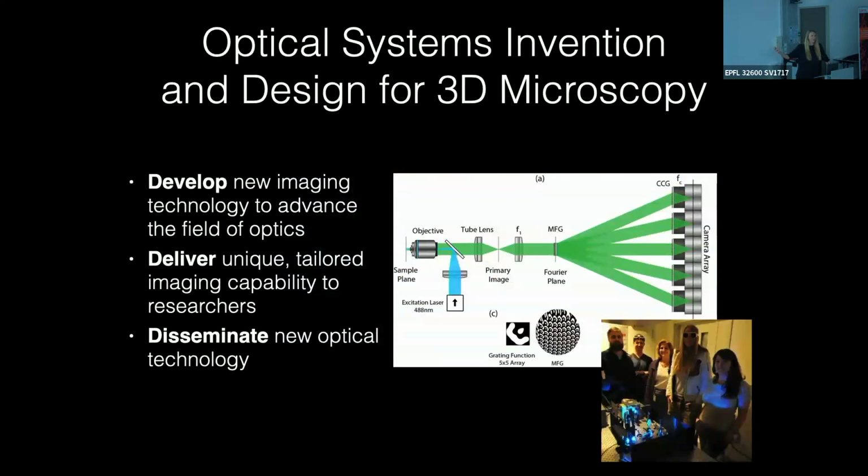So, you know, Suliana's lab and a few more labs in the world that are getting more and more visible are really just doing tool development for microscopy in academia, not at institutes and companies, but academic research. And why would we do that, right? So there are many, many reasons for doing that. One is that we want to push the field of optics forward.